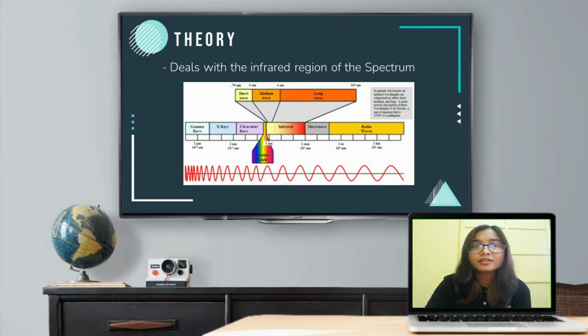Each molecule has a characteristic spectrum often referred to as the fingerprint. A molecule can be identified by comparing the absorption peaks to different data bank spectra. IR spectroscopy can be very useful in the identification and structural analysis of a variety of substances, including both organic and inorganic compounds.